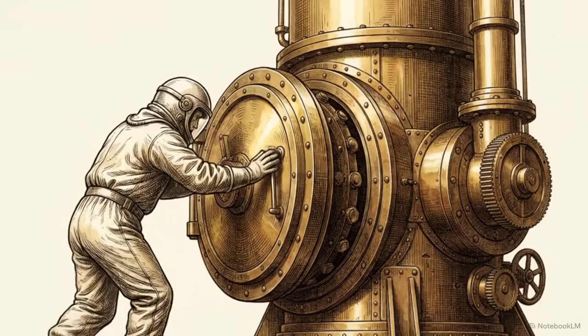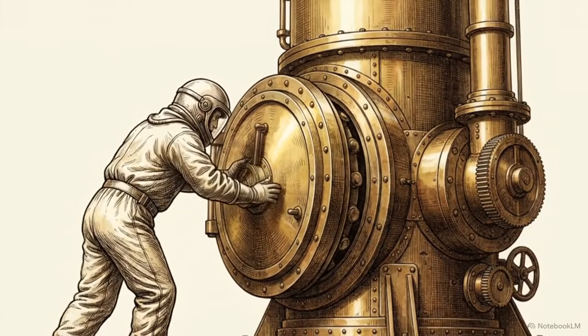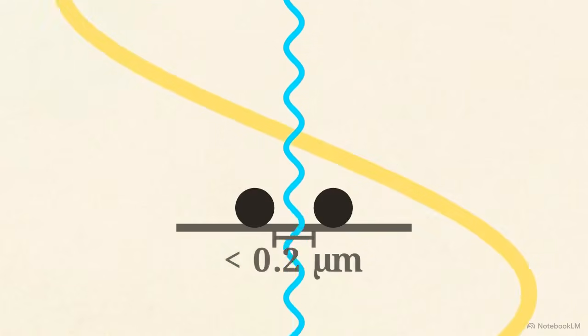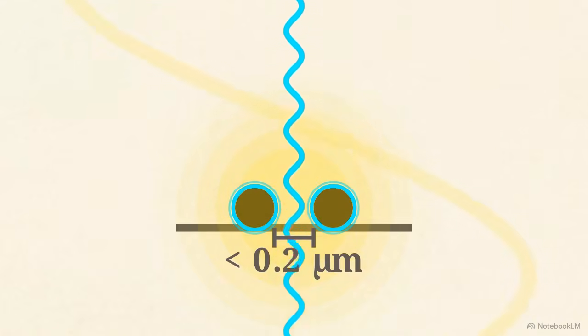To map the dense internal architecture of an organelle or catch sight of a virus, scientists had to abandon light entirely. Instead, they began shooting precise beams of electrons inside a vacuum. Electrons also behave like waves, but their wavelength is drastically shorter than visible light. This ultra-tight frequency allows the beam to effortlessly map incredibly fine details that visible light washes right over.